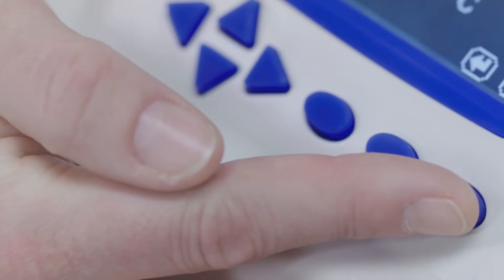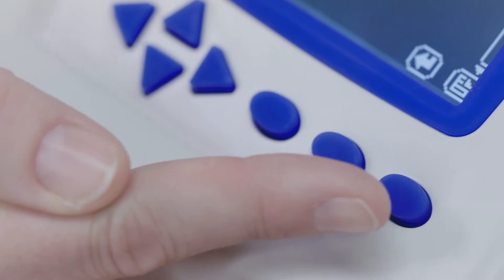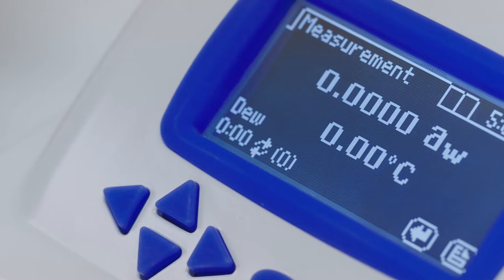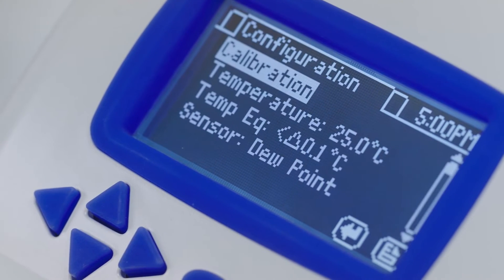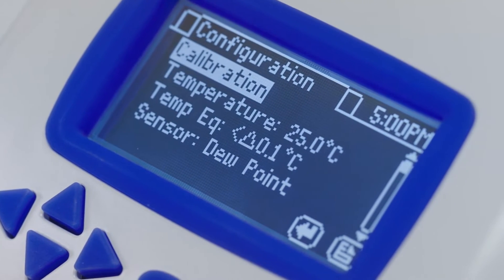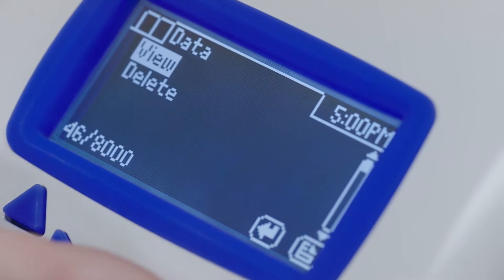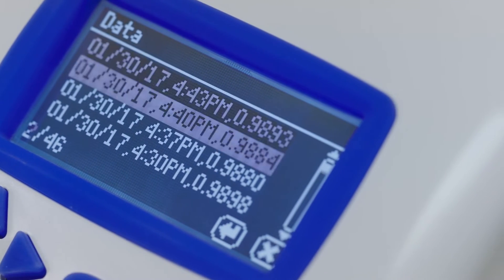One thing common to all these instruments is the screen. There are three screens that you can cycle through by pressing this button. The first one is the measurement screen. The second is the configuration screen. And the third is the stored data screen, where you can cycle through the last 8,000 measurements you have made.